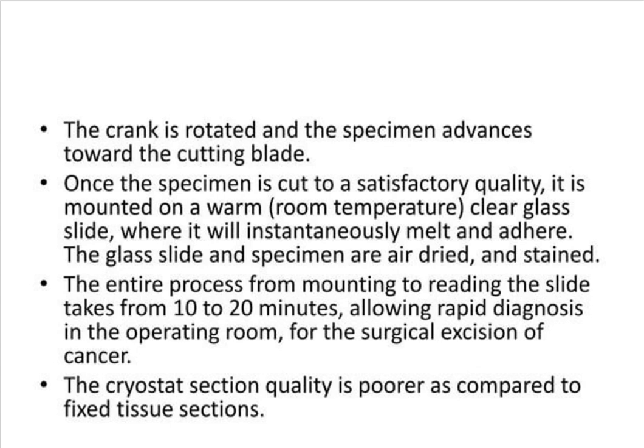This cryostat section quality is poorer as compared to fixed tissue sections. But we must be taking care. In case of quick diagnosis, we will be needing this cryostat as much as possible. We'll be seeing about cryomicrotome later.